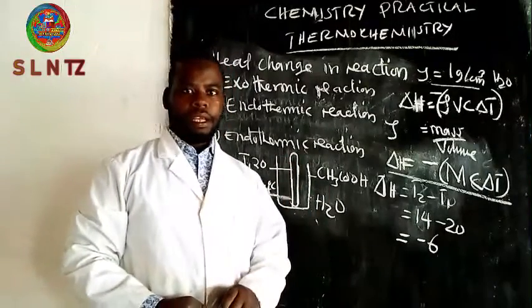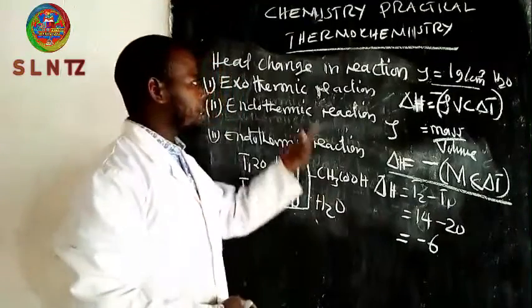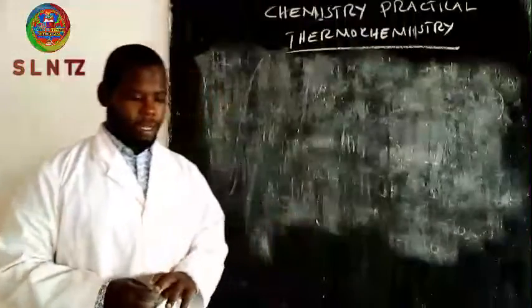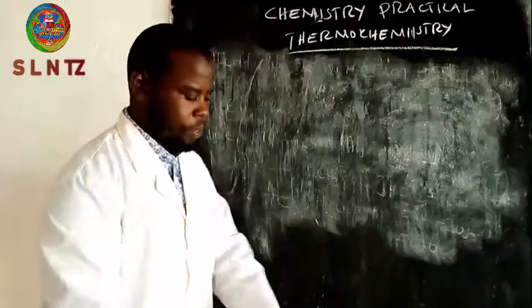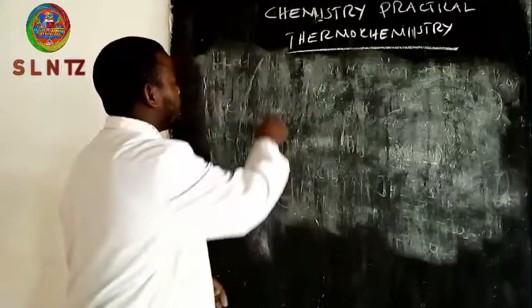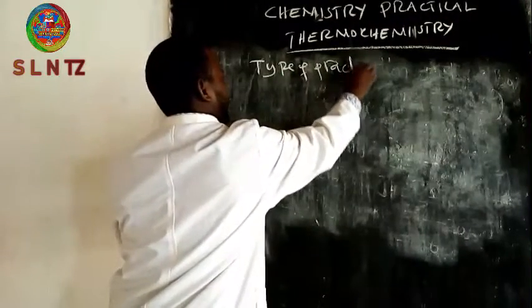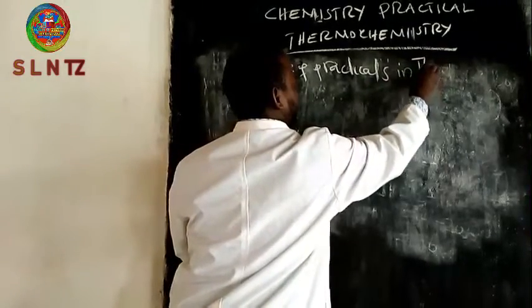Let us go to another section to understand more about the thermochemistry practical. This is the introduction to practicals. Okay, let's proceed. The types of thermochemistry practicals we are going to deal with.